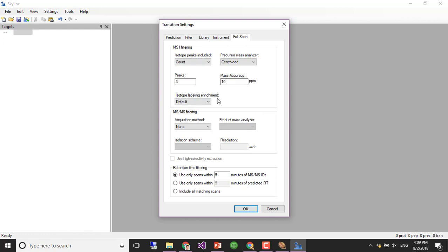So these mzMLs, the raw files originally were collected in profile, but we are analyzing them in centroid. Okay, so for MS/MS filtering, we did DIA, right? Just like before. The fragment ions are centroided. And here's kind of a trick.